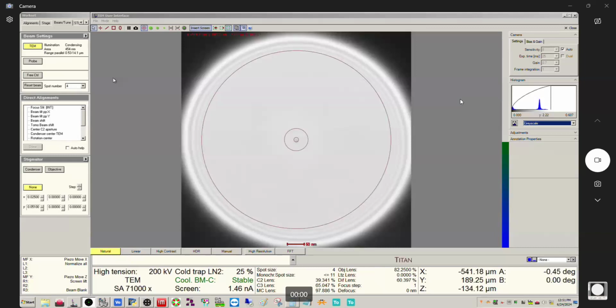In order to do this, you need a region on your specimen that is either amorphous or partially amorphous. What we have here is a silicon wafer that's got a couple of really thin epi layers on it. It has a coating of evaporated amorphous carbon, and it also has some electron beam assisted platinum from the lamella prep process. So either of these two regions will work well for this.